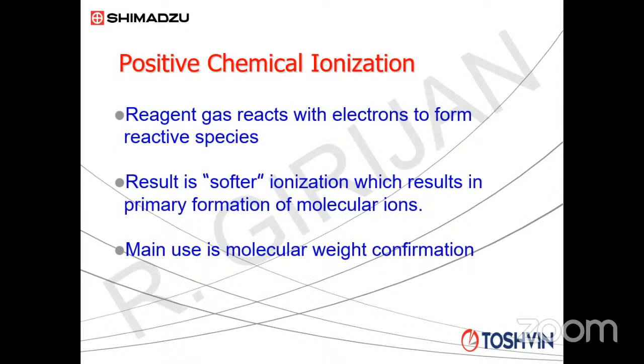So when we talk about GCMS operation, our carrier gas, that is our mobile phase, is only high purity helium. We require only one gas. Like in GC, we require multiple gases, nitrogen, hydrogen. Those types of gases are not required in the case of GCMS. We require only high purity helium. So only one gas is required, and it has to be high purity.